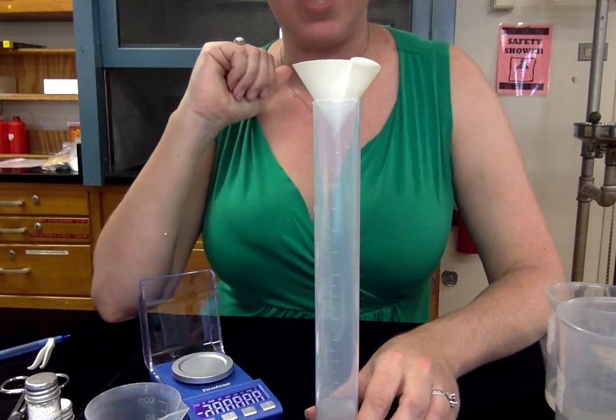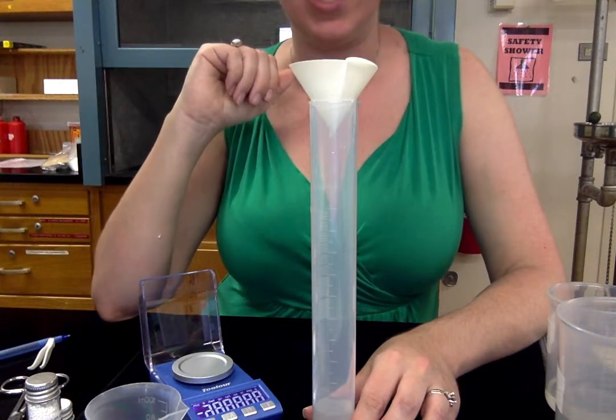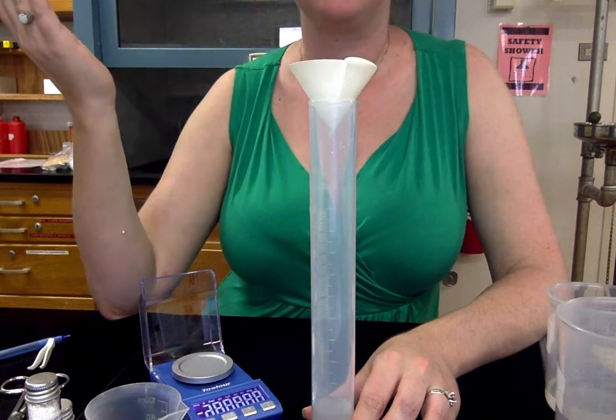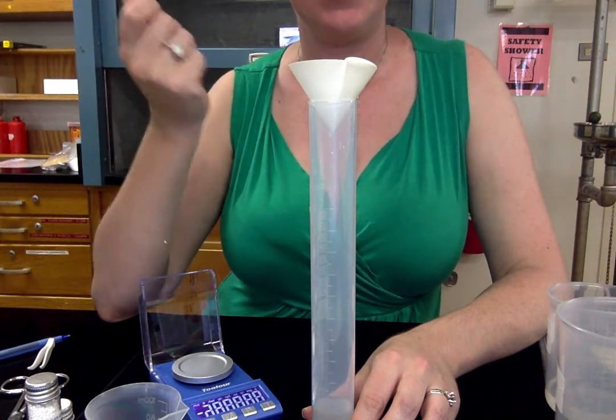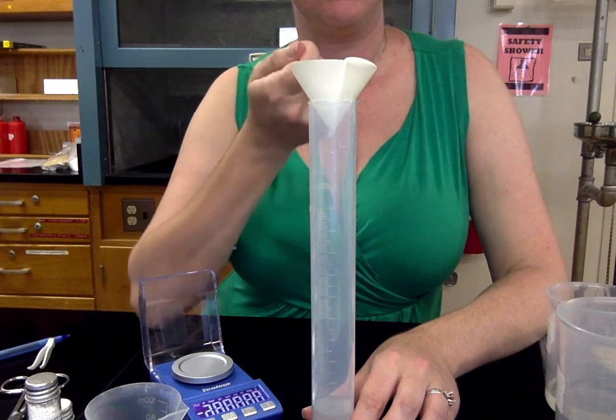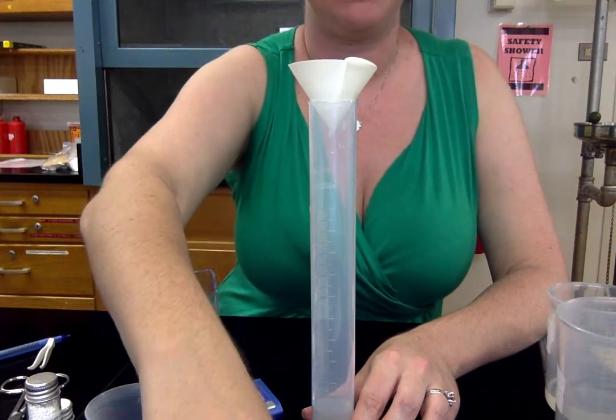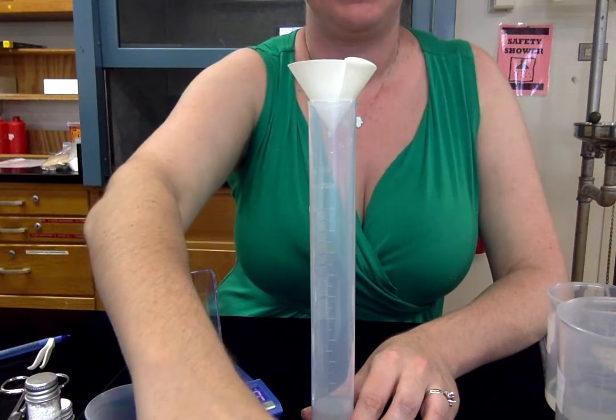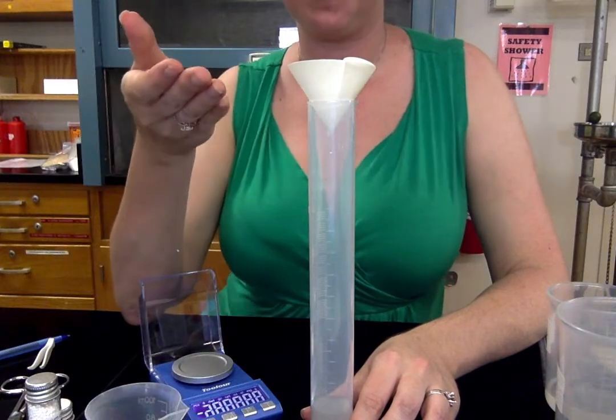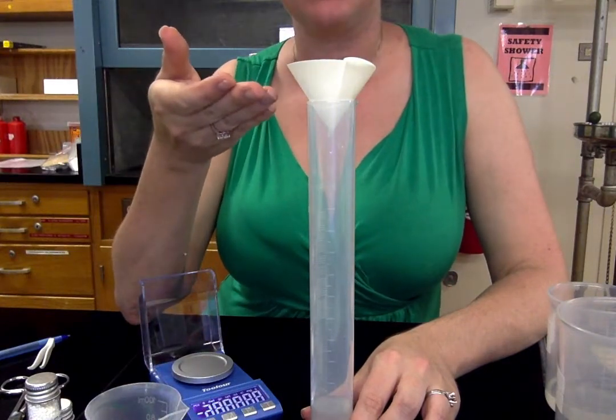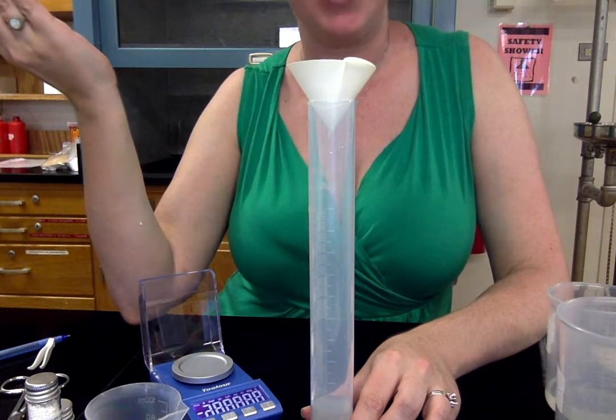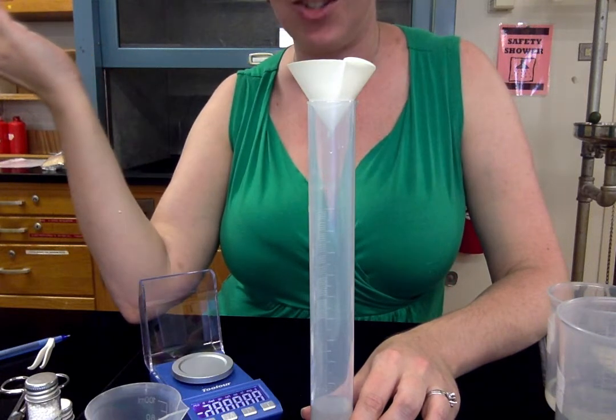And this precipitate, by the way, that you're creating is chalk. When you write with chalk on a chalkboard, that is made out of this material. It's calcium carbonate. So it is kind of an everyday material that you're making, this calcium carbonate. All it is is chalk.